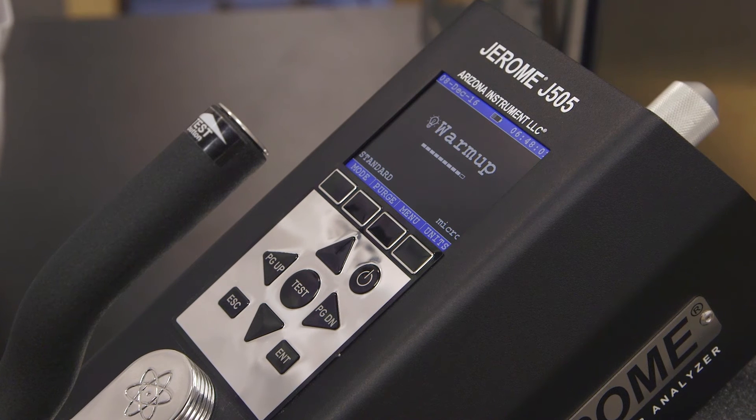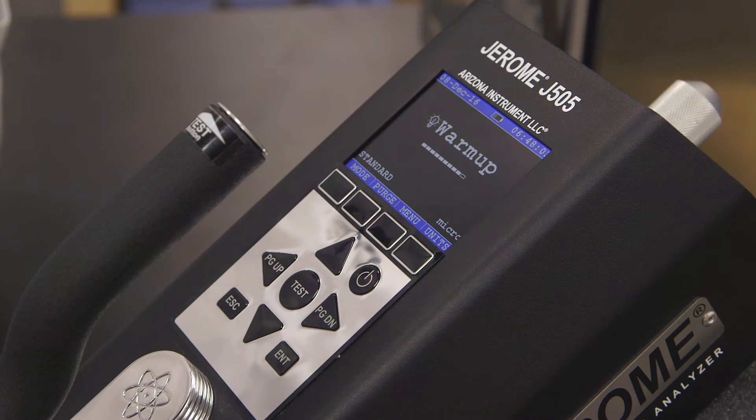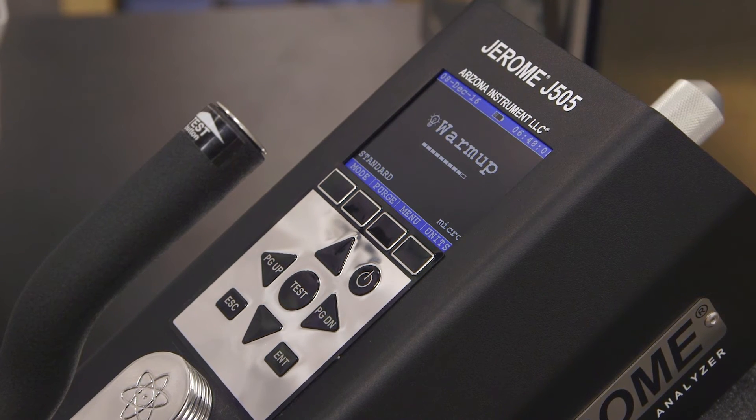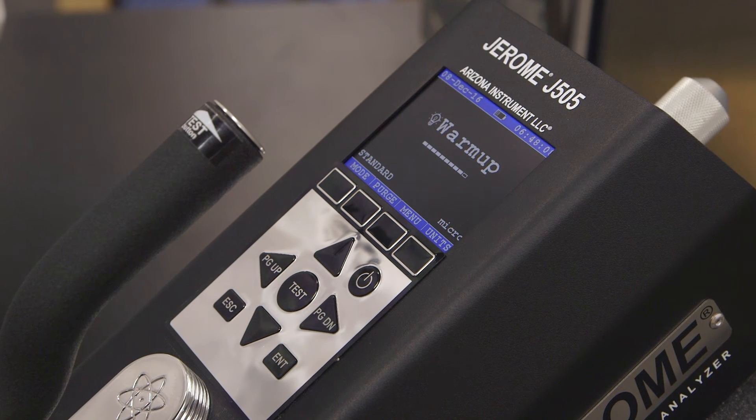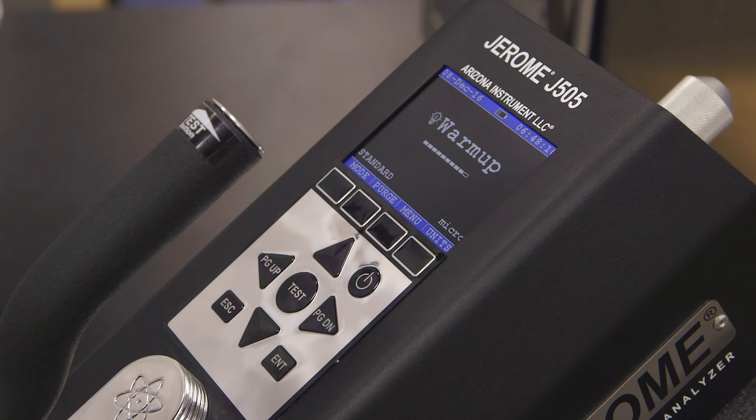After powering up your J505, a warm-up screen will appear. Warm-up helps stabilize the instrument and takes approximately six minutes to complete. When the word ready appears on the screen, you're ready to take a sample.